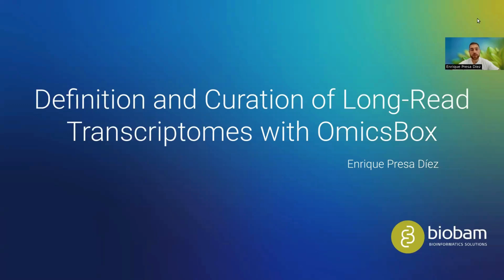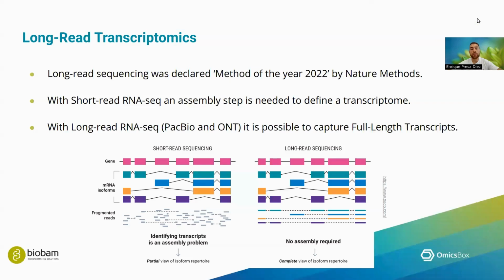Okay, so in this first part of the webinar, we will focus on the definition and curation of long-read transcriptomes with OmicsBox. First of all, it is important to ask ourselves why long-read sequencing is important in transcriptomics. The fact is that long-read sequencing was declared Method of the Year 2022 by Nature Methods.